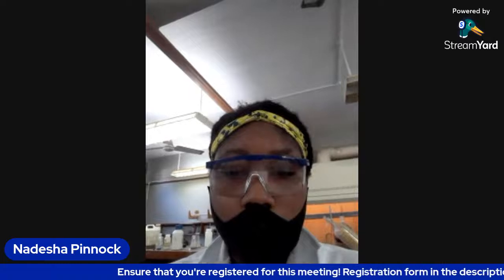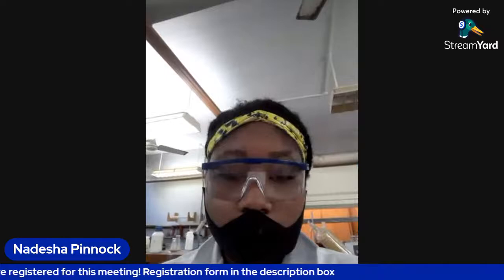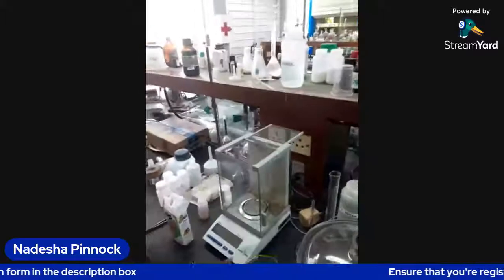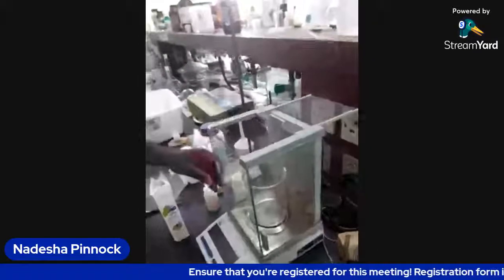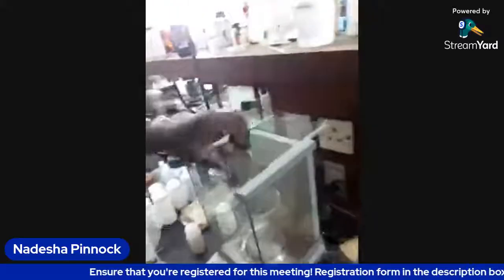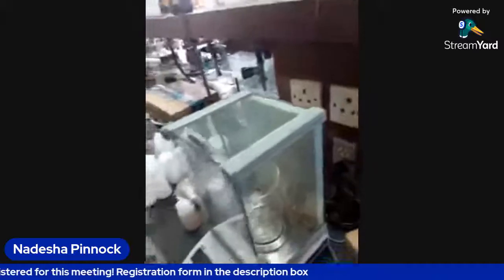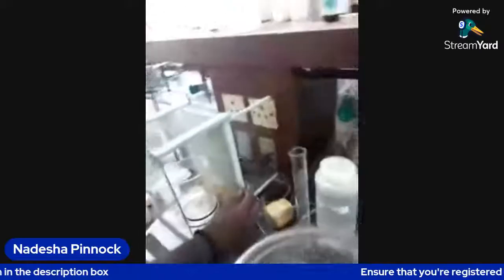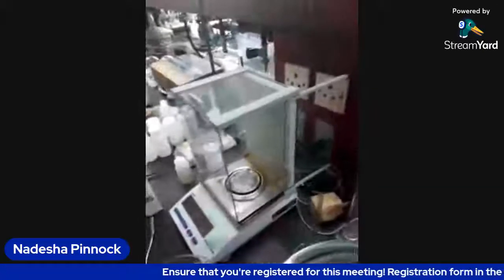We need about 10 grams, I think. Is it 10 grams? Right. So here we go. So we'll be weighing out 10 grams. Right, so we add our beaker and then we zero the balance.